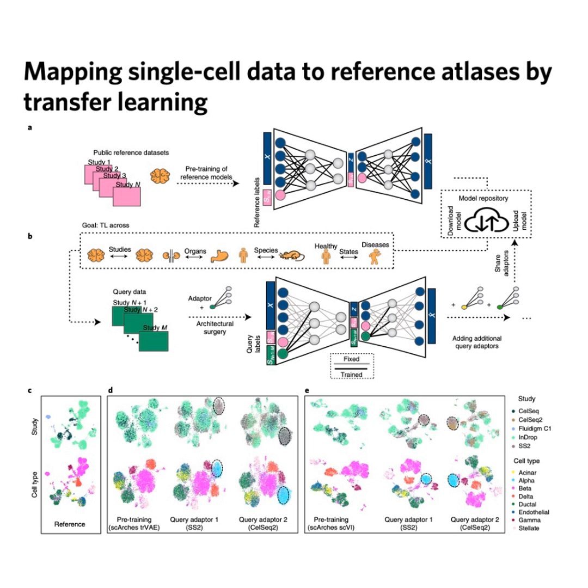Which brings us to the next step. What kind of knowledge can we transfer? Well, there are 2 main types. The first is discrete labels, which is basically just automated cell type annotation. Tell me more. So there was this great example where they mapped a query data set of about 90,000 mouse cells onto a massive reference atlas called Tabula Senis. The goal was simple. Could the model automatically assign the correct cell type label to the query cells?